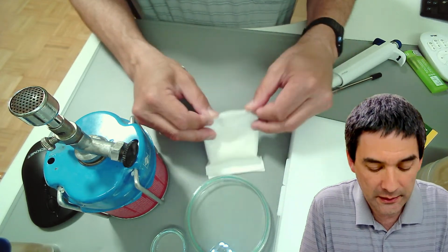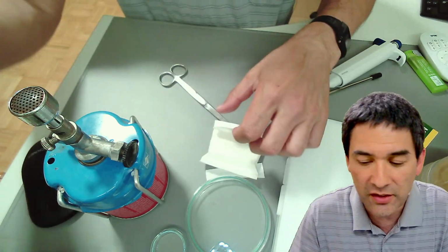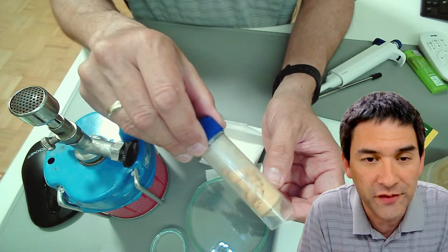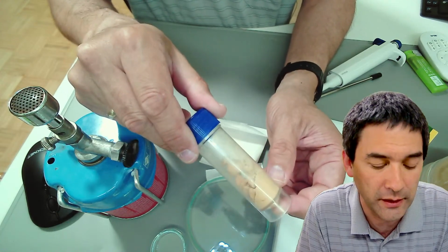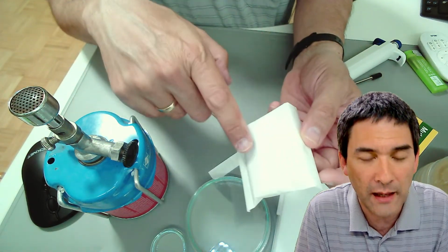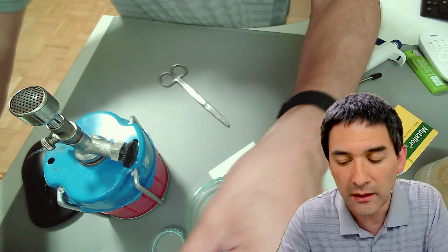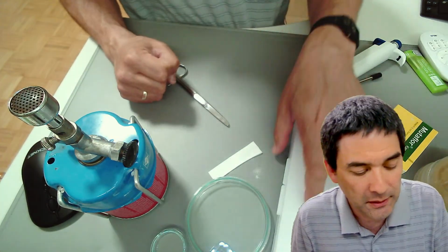Another thing that I used is yeast extract. Yeast extract is not yeast, but the extract of yeast, and this is also dissolved in water. Then this serves as a food source for the bacteria. What I've done is I used 15 grams of agar on 1 liter of water and 3 grams of this yeast extract. I did not adjust the pH. Normally, you're supposed to do other adjustments as well, but I didn't do that.